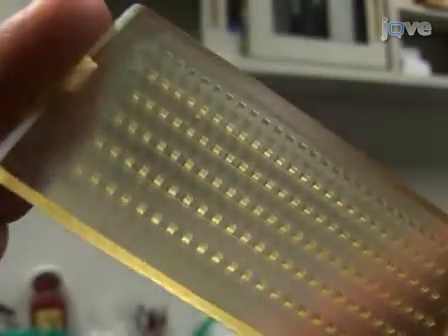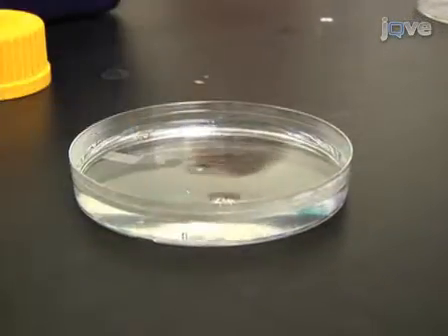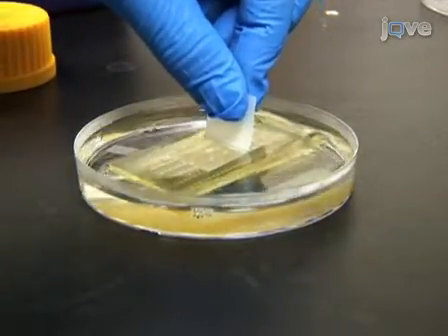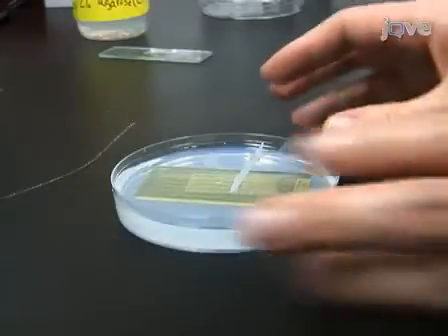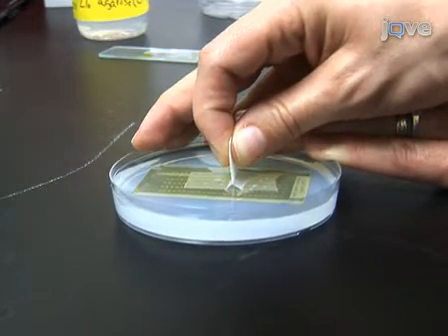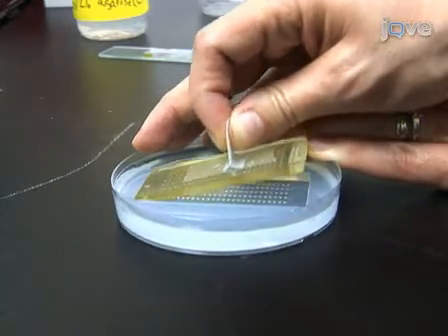Prepare injection dishes in advance by floating a plastic mold with paired rows of wedge-shaped protrusions in a petri dish half filled with molten 1.2% agarose in embryo medium. Once the agarose has solidified, remove the template, leaving rows of triangularly shaped wells, each just large enough to hold one embryo.